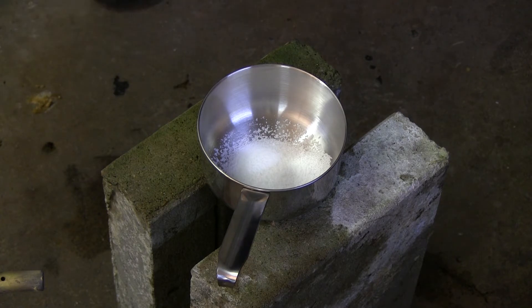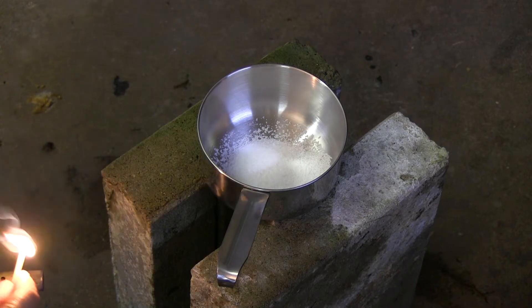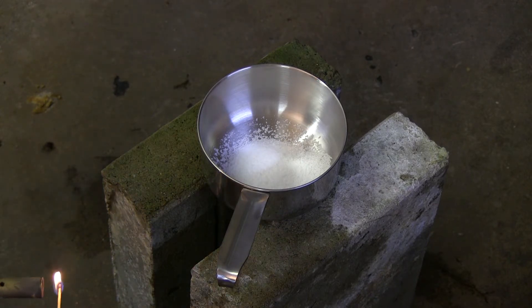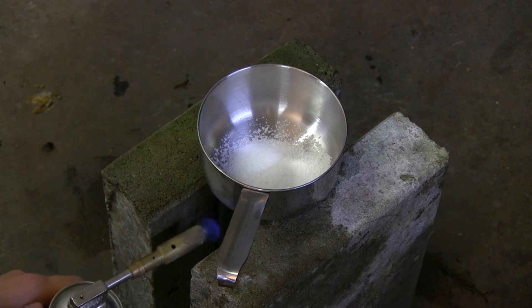Next, I'm going to get my gloves, and we shall see what happens. The first experiment will be: can I even melt the sodium hydroxide? I'm going to use my blowtorch and try to get it to melt. It should be fairly easy, because sodium hydroxide has a melting point of just above 300 degrees Celsius.